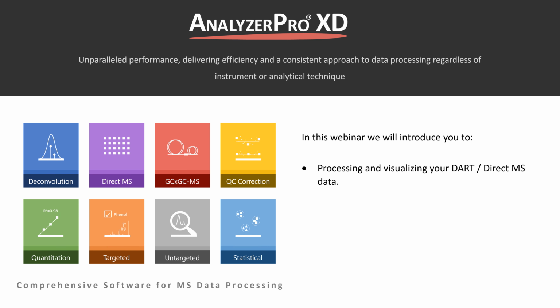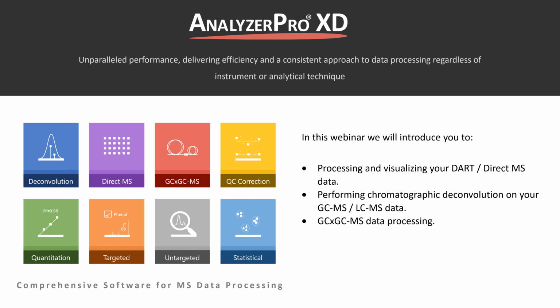We will first look at how AnalyzerPro XD can be used to visualize and process DART MS data. We will then look at how to process GC and LCMS data using our proprietary algorithms to detect obscure components that existing software packages are unable to find without additional information. I will then show you how we have extended this process to GCxGC-MS data. And as we process each of these three different types of MS datasets, we will also show you how you can benefit from the statistical tools in AnalyzerPro XD.